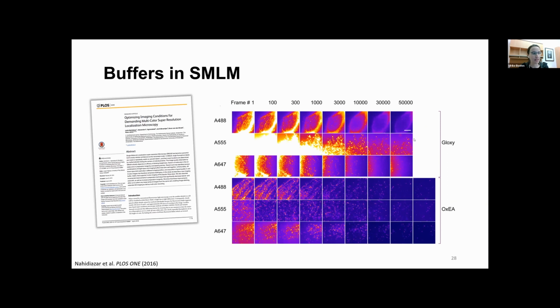And in this specific study, they even compared 2 different buffers. This is necessary. If you are not using an already optimized protocol, this is really something which I highly advise you to do. Meaning, if you aim for a super resolution localization microscopy experiment and don't know where to start, this kind of optimization step, to see whether things are still blinking, is really something you should do, unless you have an expert on your side who can precisely tell you what good conditions are.